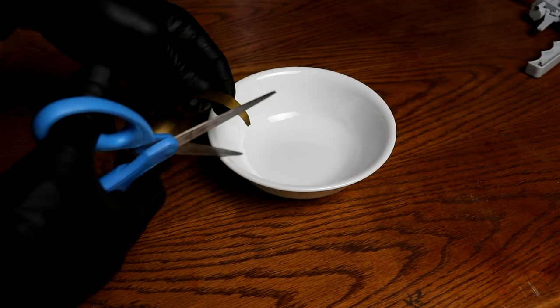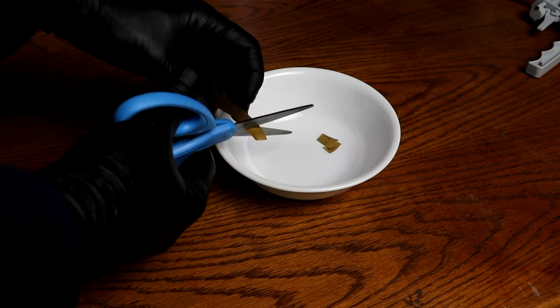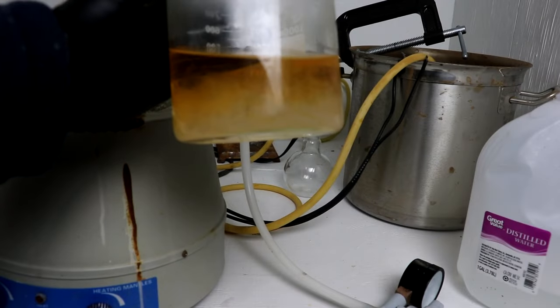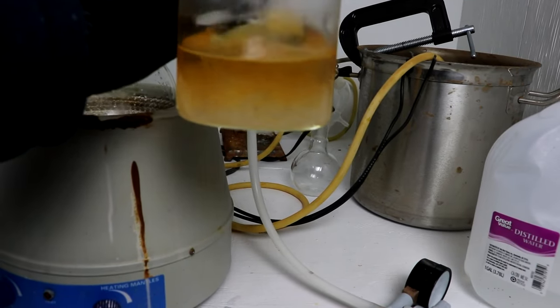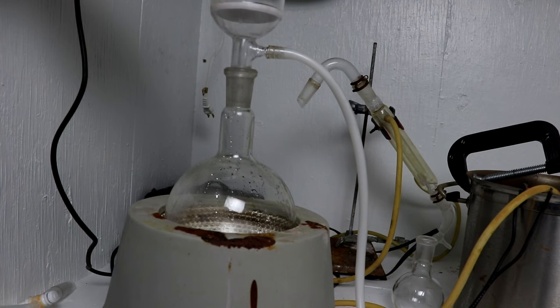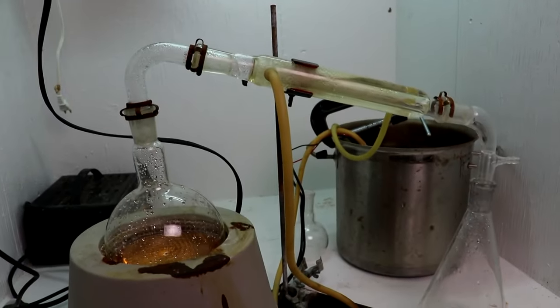While I'm waiting for that to cool, I may as well cut this gold into little pieces that are small enough to fit down the neck of a reaction flask. A lot of the sodium sulfate has precipitated out now that it's cooled. This leaves us hydrobromic acid in solution. Of course, it's very crude, so I'm going to first filter it and then distill the acid to get pure hydrobromic acid.